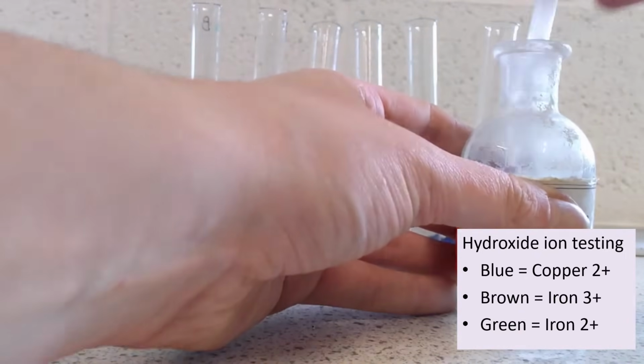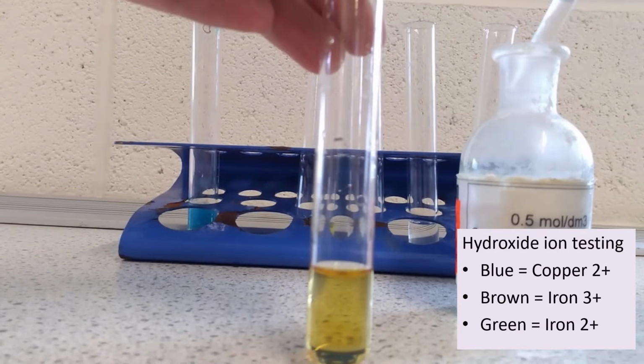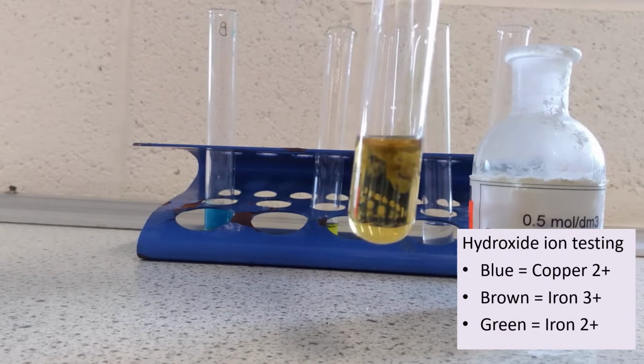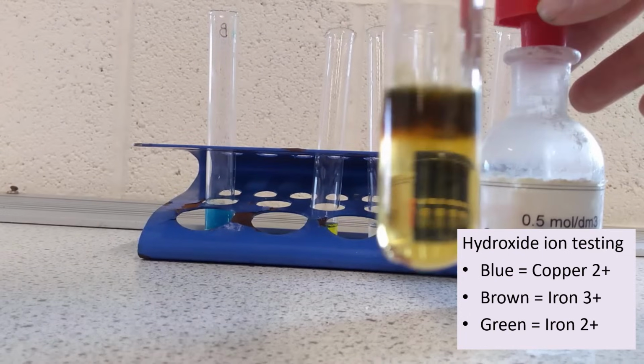And then likewise, this next one is iron 2+ ions, because remember, iron being a transition metal has multiple stable ions. So these are the iron 2+ ions. And they produce this characteristic sort of dark green colour.